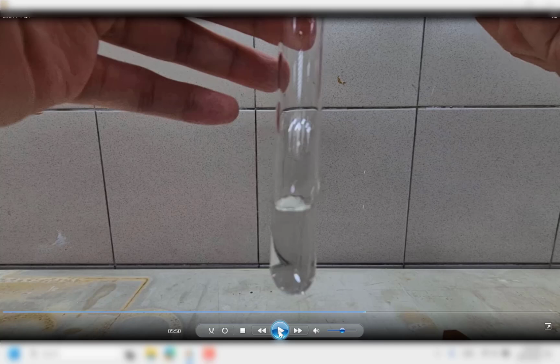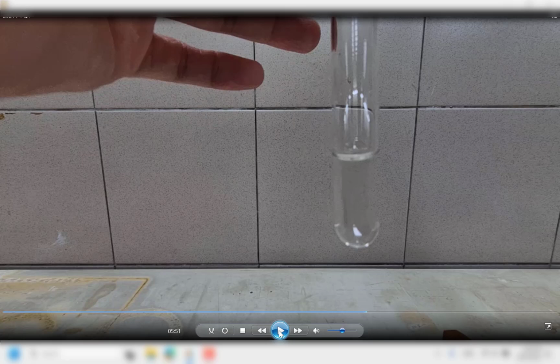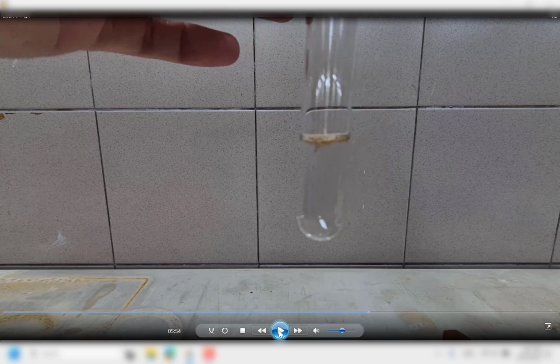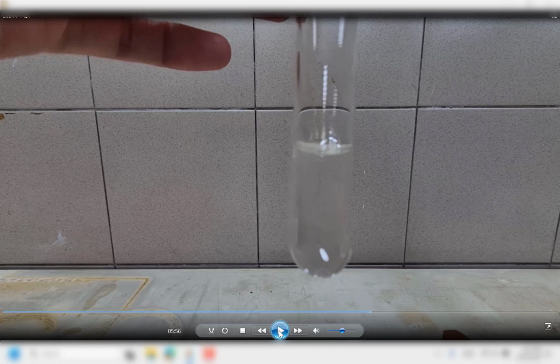But what happens when you add in H2O2? Sorry, what happens when you add in sodium hydroxide? Take note of it carefully, especially at the top of the liquid. One drop in, you notice formation of brown PPT, and then a little bit of effervescence. You can see the effervescence over here. I'll continue.